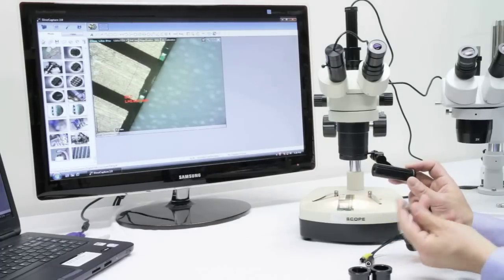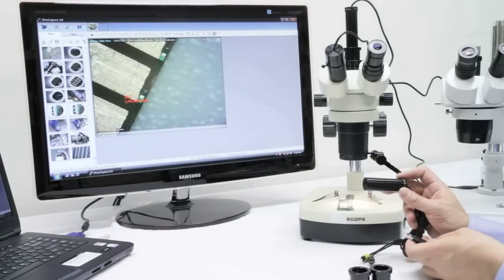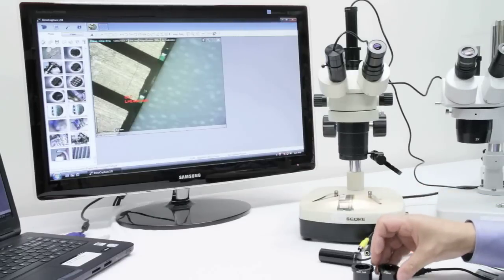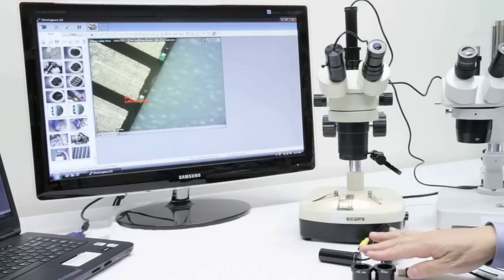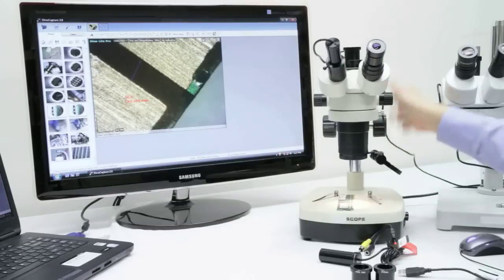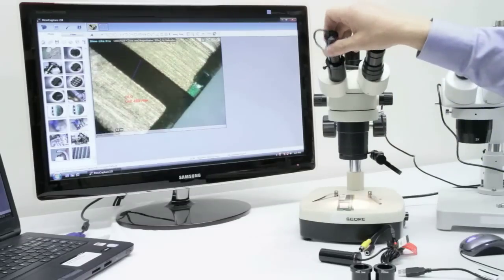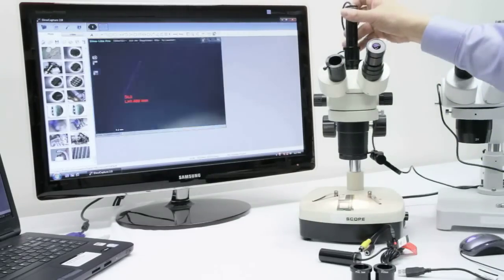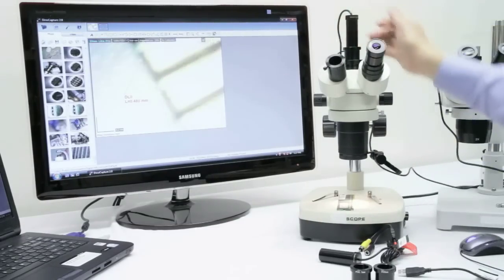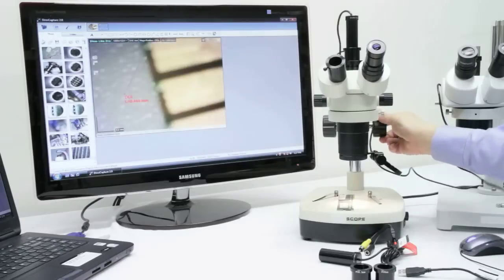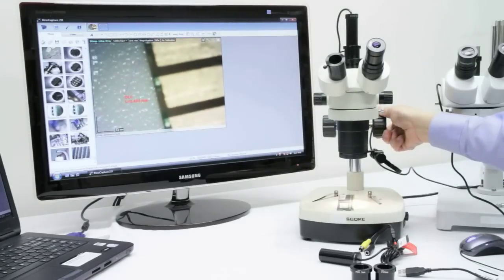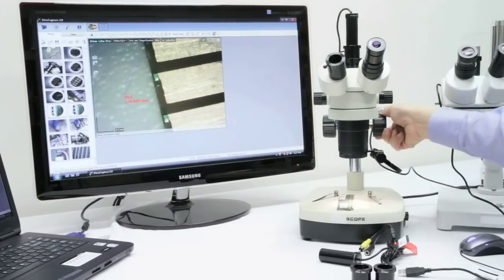Both of these eyepiece cameras come with a 30mm and 30.5mm adapter. The AM423XC also includes a C-mount adapter, which can fit directly into an available C-mount or trinocular slot with a minor focus adjustment.